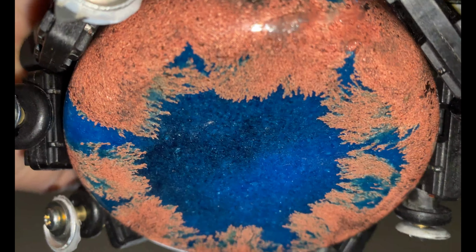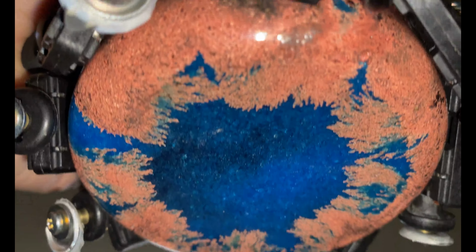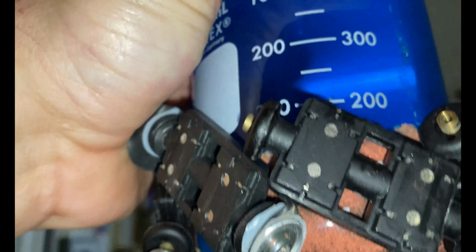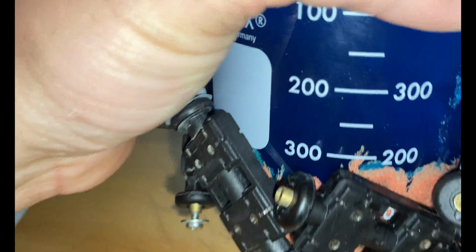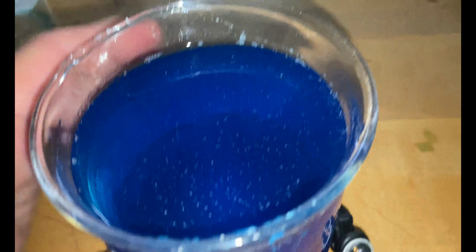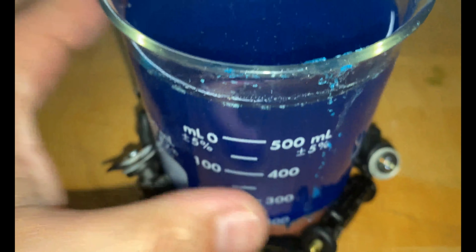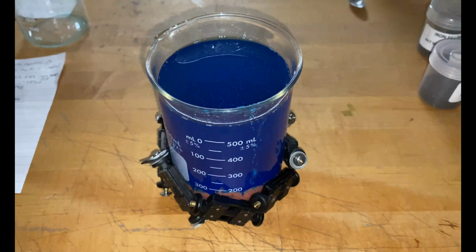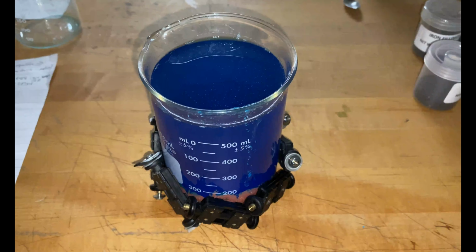but will it hold together? That's the question. Will it fuse together or not? So, I'm going to leave these magnets on here overnight, and we'll see what it's like tomorrow.